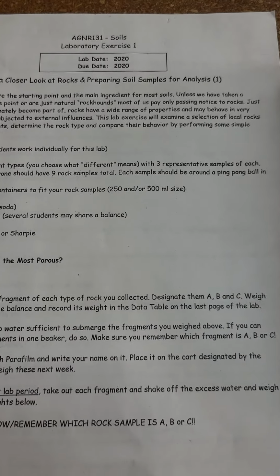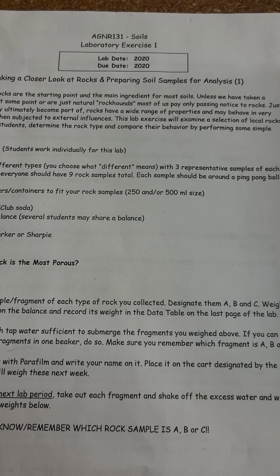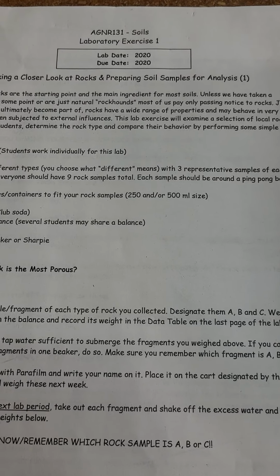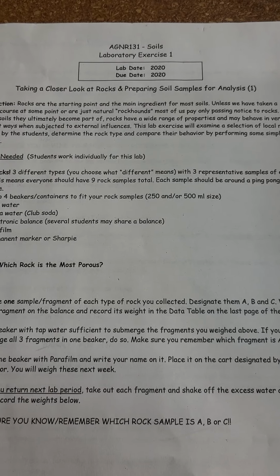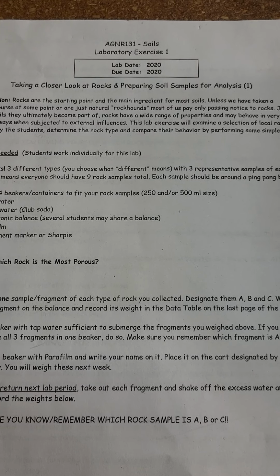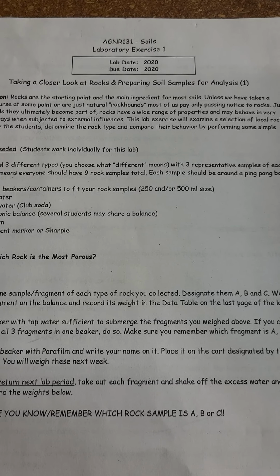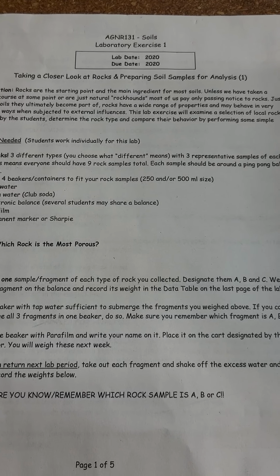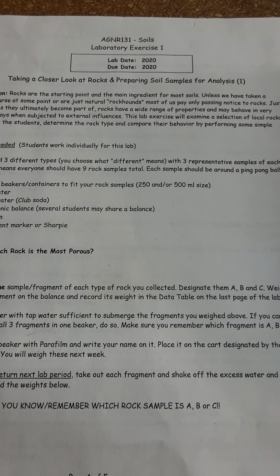Okay, this is AGNR 131, Soil Science. This is the Lab Exercise 1 video. And you can see here, if you look at this paper I've got in front of me, it's called Taking a Closer Look at Rocks and Preparing Soil Samples for Analysis. This part of the video is going to be focused on just taking a closer look at rocks.